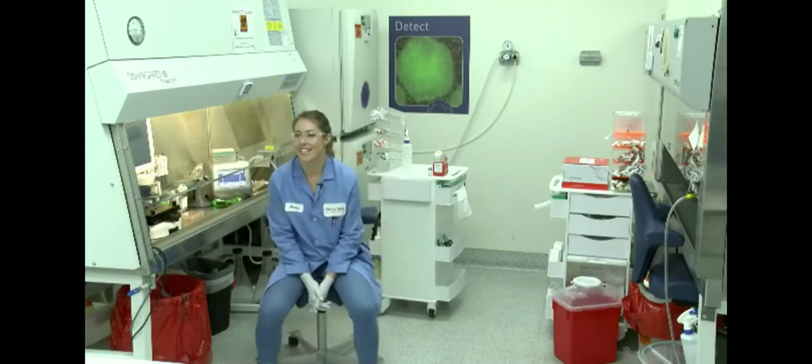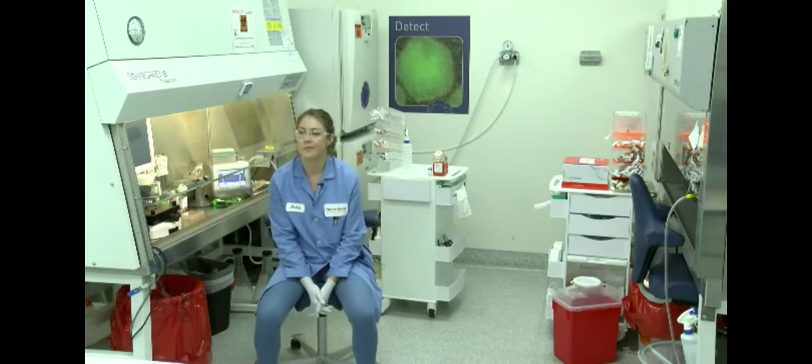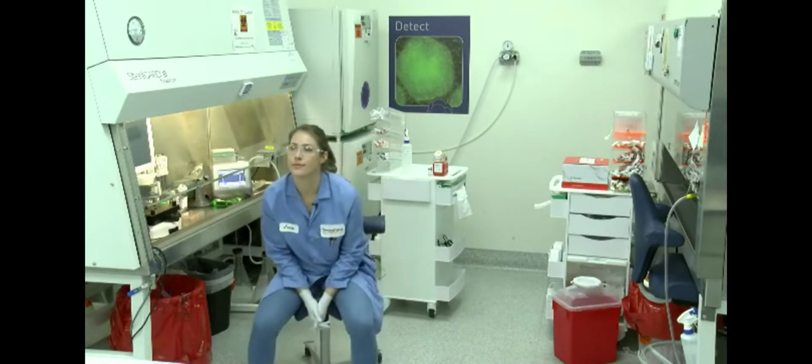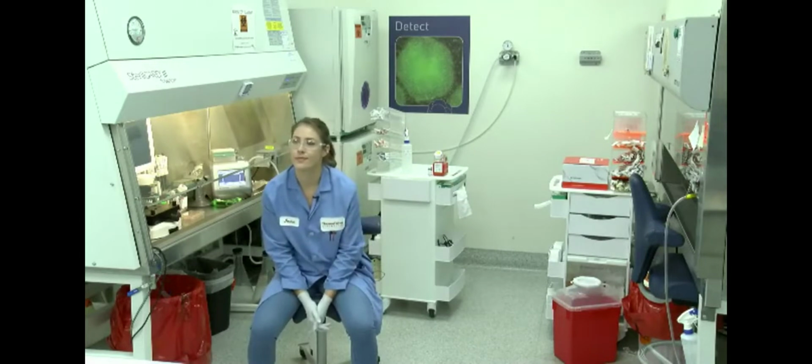This is Eric speaking, and I will be working with Jackie through some of the questions that we have received online. So I'll try and divide them up into different categories. One group is more around the instrument itself. So could you speak a little bit more about the difference between the 10 microliter tip and the 100 microliter tip that you mentioned?